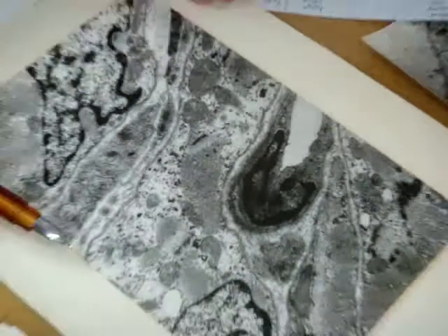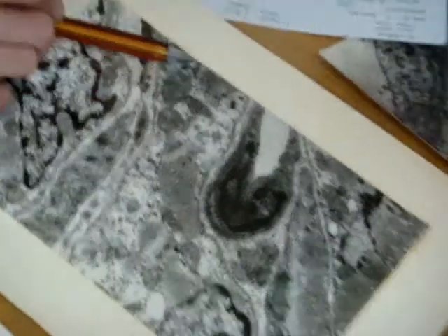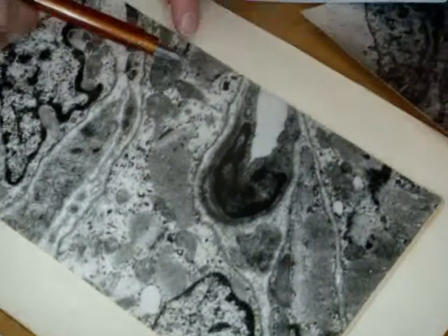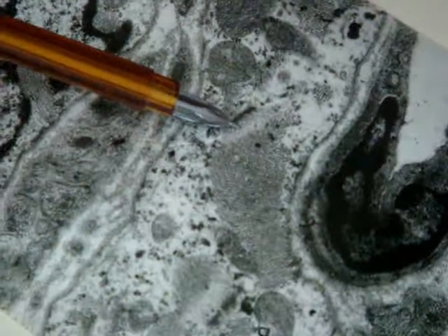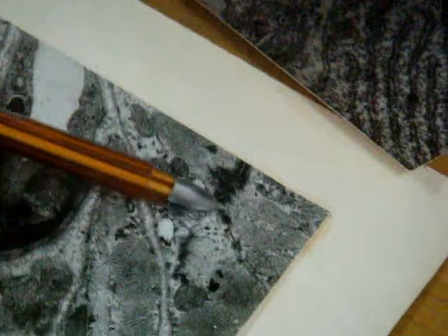What is the tissue? A lot of cells we can see. What is the tissue all these cells belong to? Muscle cell, yes, striated muscle tissue. That line, this oblique section, A band, I band. This is a cross section through the A band, thick and thin filaments, this only I. That line. Is this skeletal or cardiac? Look attentively. What is it? Junction. This is cardiac. So this is one cardiomyocyte, one more.